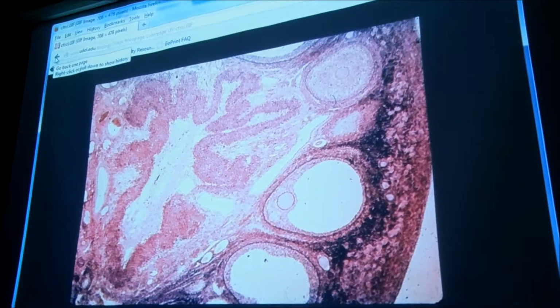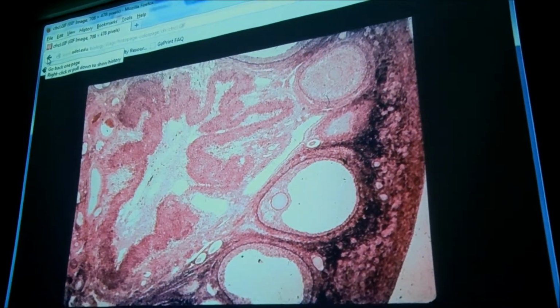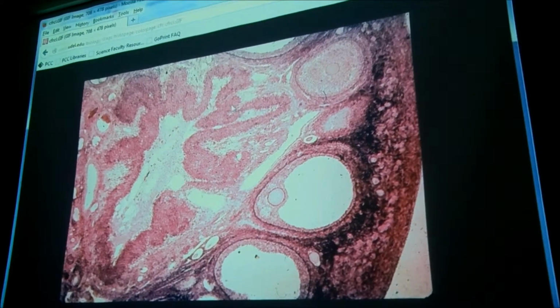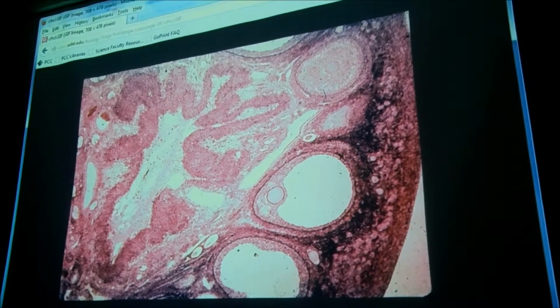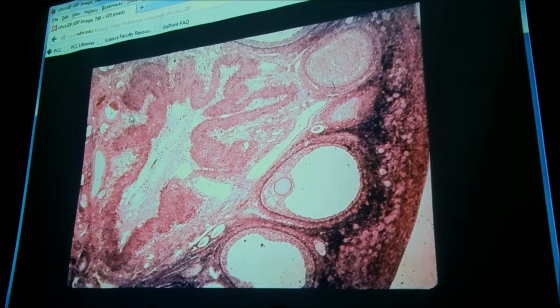Look at the size again on that one. The luteum's bigger than all the follicles, right? It's huge. And the albicans would be smaller than the follicles. Where's the albicans on here? There's no albicans. There's all luteum. That's just one big one? Yep, that's one big luteum. So it gets bigger than the follicles it has.